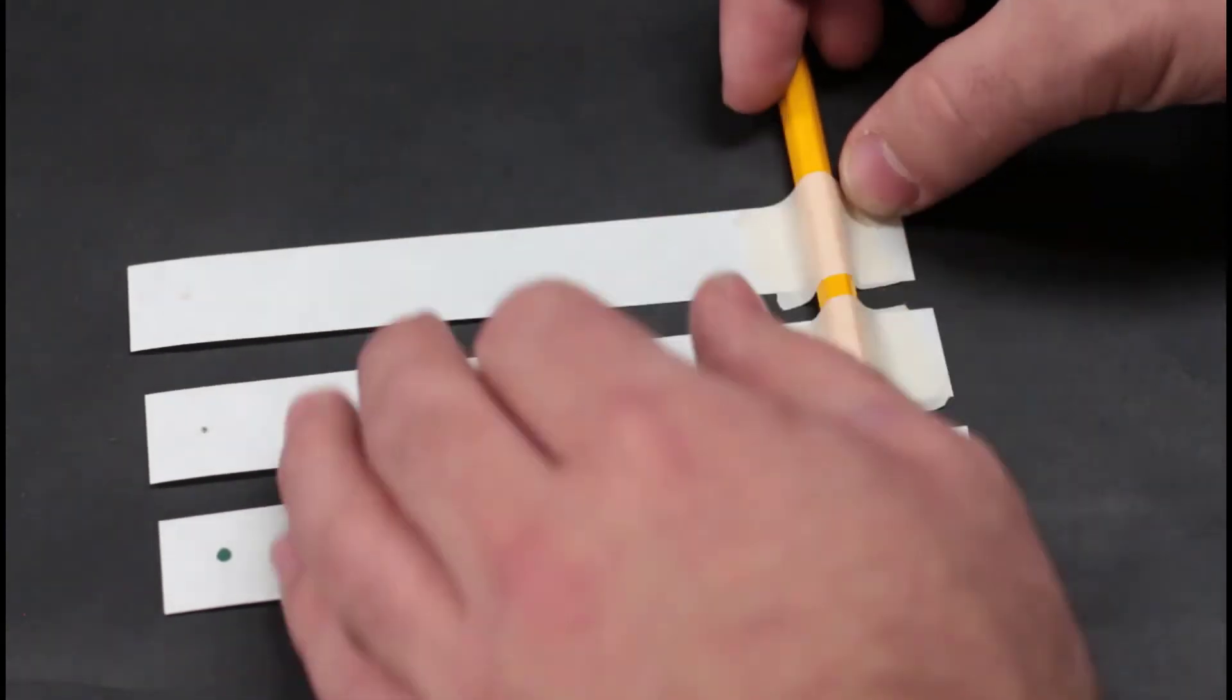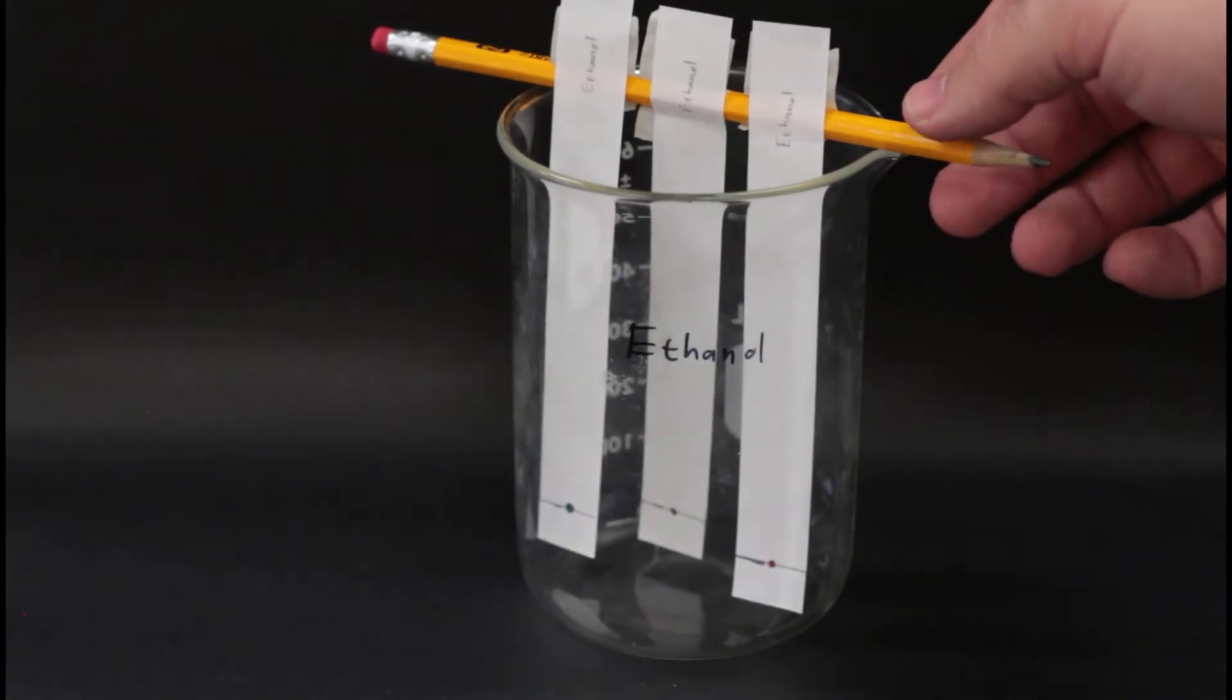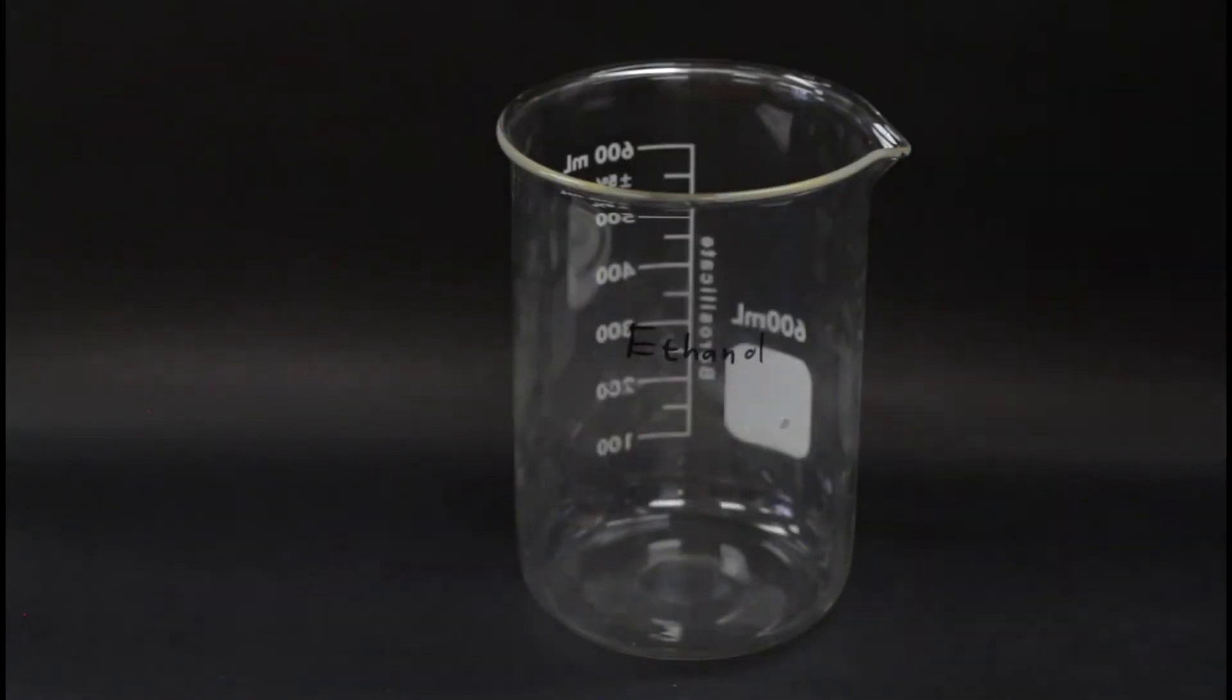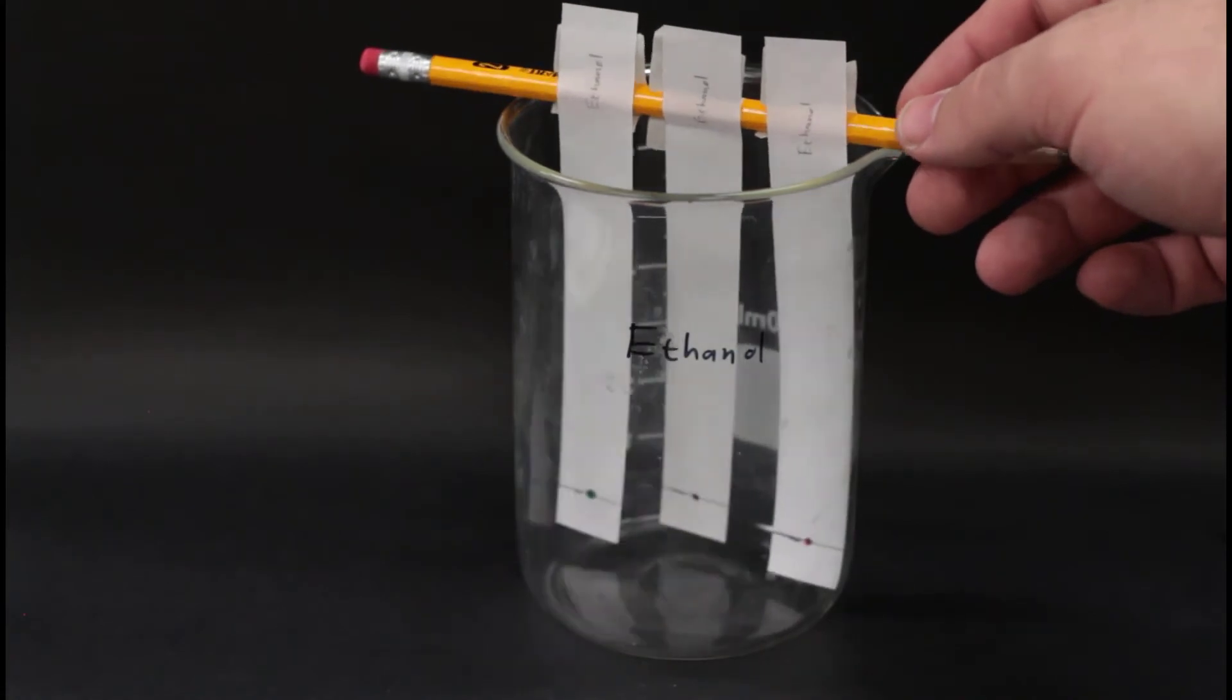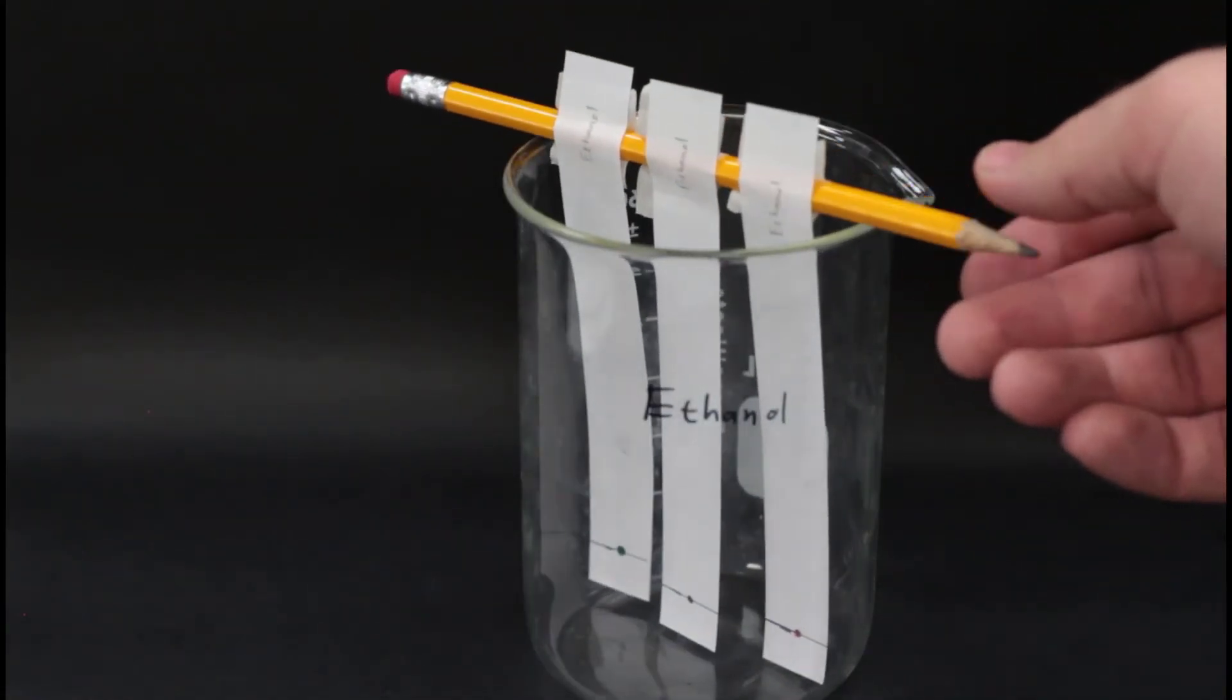Next, tape the paper to the pencil and make sure it's at the proper height. Again, the paper should be just above the bottom of the beaker or barely touching the bottom. You may have to adjust your paper and your tape a few times to get it exactly right.